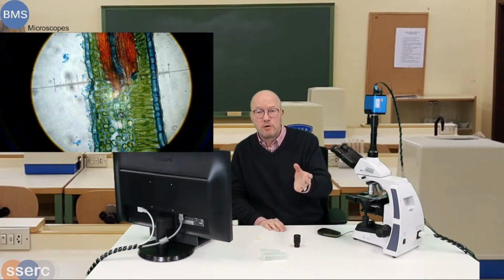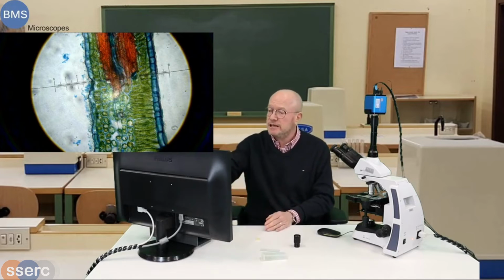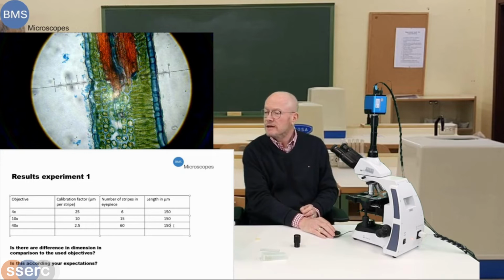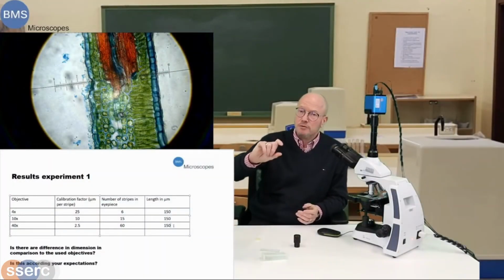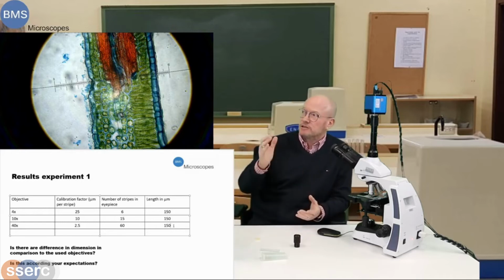And we spoke already about measurement failures, about reading errors, etc. You can see here reading error. If I look at the tree here, I start here, but you can see there's a bit of information still on the left-hand side. Does that belong to the slide, to the actual distance that I want to measure? That, of course, you have to allow yourself some space there. But nevertheless, it was expected that all these figures should be more or less into the same range, and that is what we've seen here.